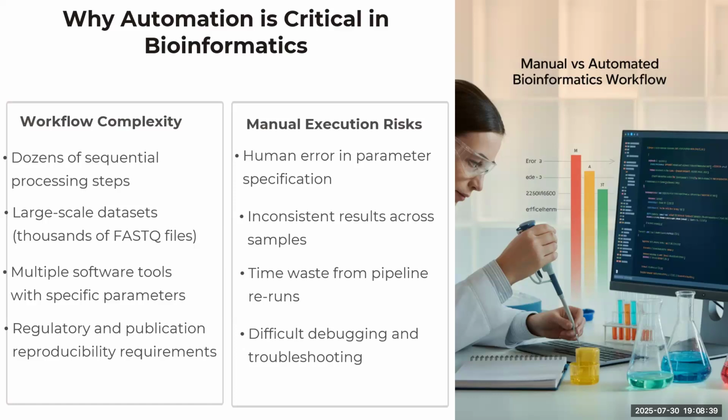Automation helps us save time, and it gets us the same results every time we run the analysis, right? The automation process provides consistency and efficiency in the results. We can automate batch processing across multiple tasks and save our time. We can also easily debug the issues we are having. And we can run the pipeline anywhere, on a local machine, on high performance computing clusters, or even on the cloud. That is the upper hand automation provides us.